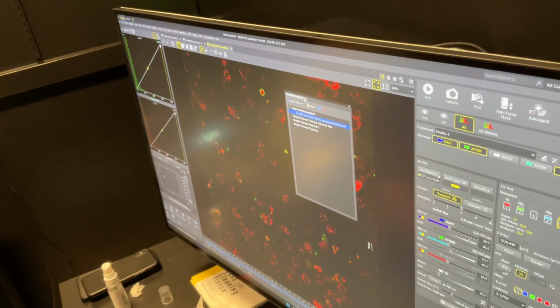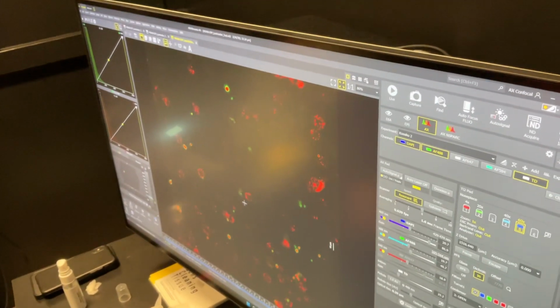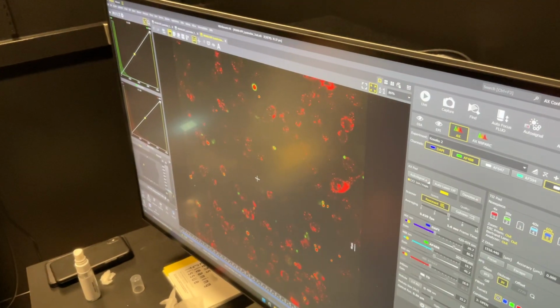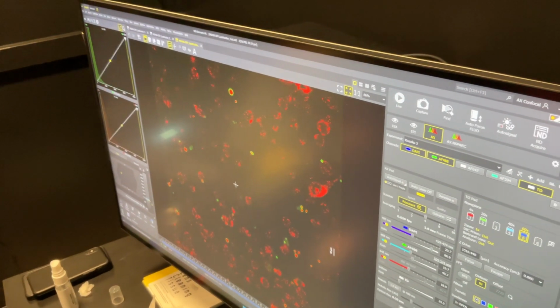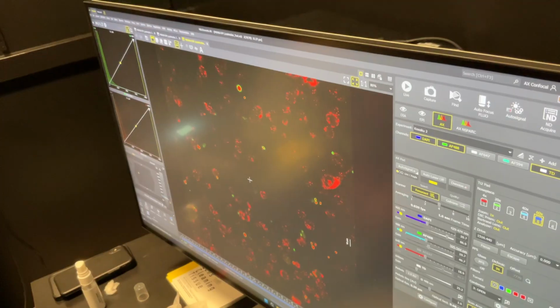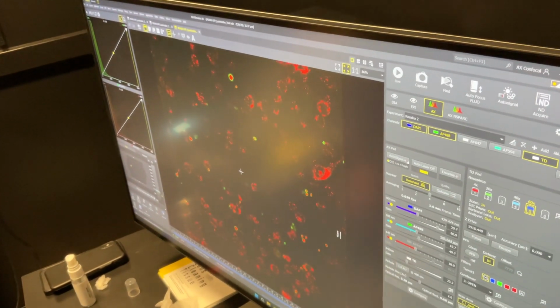All right. Anything else? I feel like the laser tracker is pretty condensed too. Yeah, the Imaris software is technically not our lab, so I've kind of been using it on loan. I think you'll find that our stuff is pretty powerful once you get the basics of how it works. Yeah. And the saturation I have to fix while I'm taking the image.